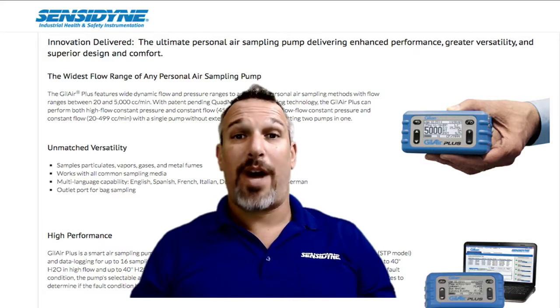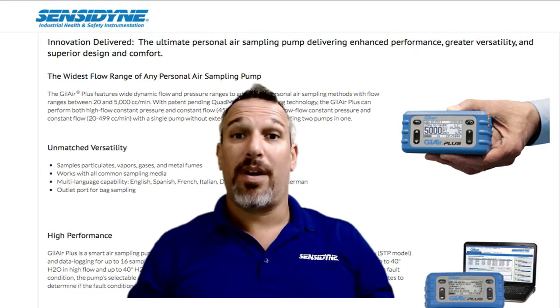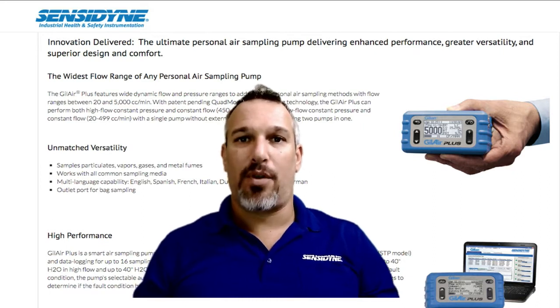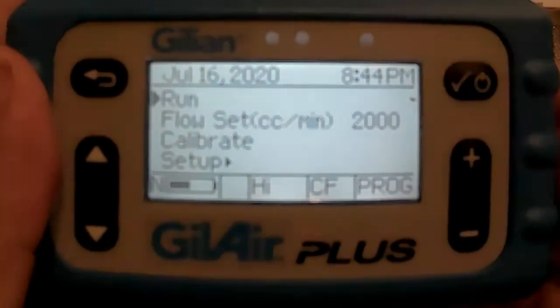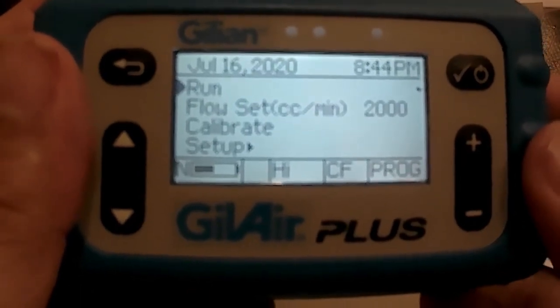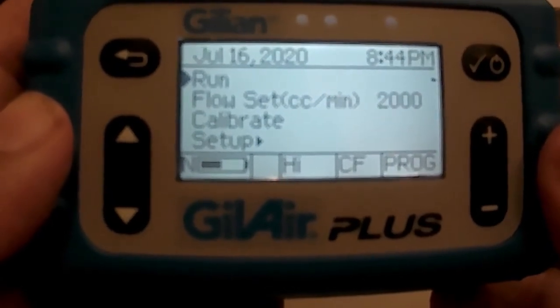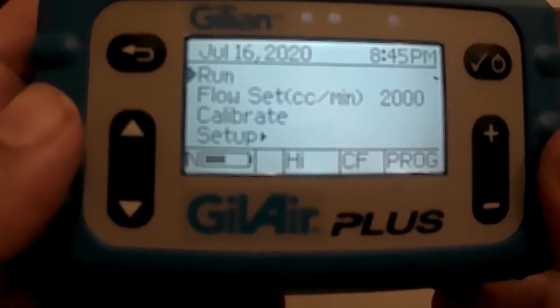Hello. Today we're going to review how to program your GillAir Plus sampling pump. I will show you how to both program it manually on the pump itself and also how to set the program through your Sens9 Gillian Connect PC application. We are going to set a program to have the pump start on a specified date and time, run for a specific amount of time, and then shut off on its own.